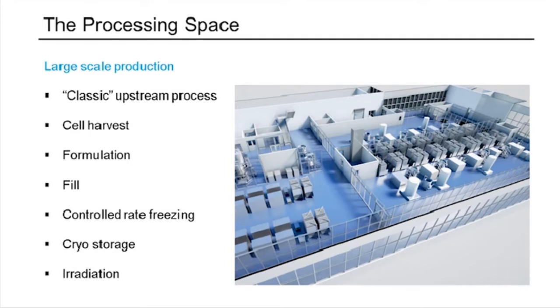Now, in this case, where the real difference is between classic biotech, the cells themselves are the product. So when you are doing harvest, you have to take into account things like shear sensitivity plays a big part. And so there's lots of different kinds of equipment that can perform that activity. Centrifuge tends to be fairly popular, and there's a number of different offerings available on the market, both in terms of scale and ranges. And certainly you want to accommodate something that can have low shear and accommodate high cell densities for dosing and or further processing.